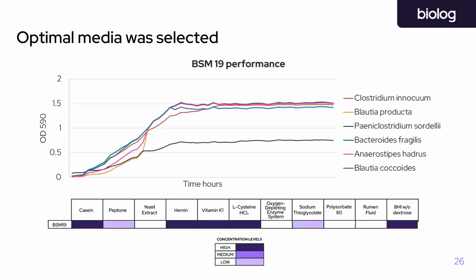As a matter of fact, we're thinking of suggesting a 12-hour analysis period, which is really where we can see most of the growth and make our conclusions. This 12 hours would greatly impact your experimental workflow, giving you a higher throughput, being able to analyze more cells during a shorter amount of time. So within 12 hours, you should be able to see results out of this.